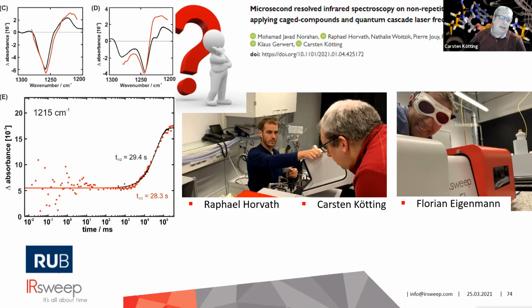For these experiments, actually, we have had, I think, 60 micrometer path lengths. And for the FTIR, you usually use 6 or 10 micrometers. So this gives you an advantage of a factor of about 6 for the signal.